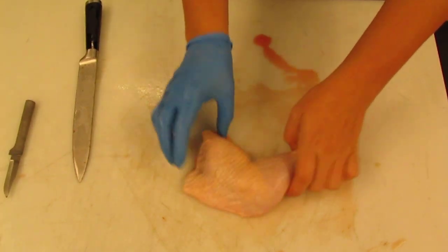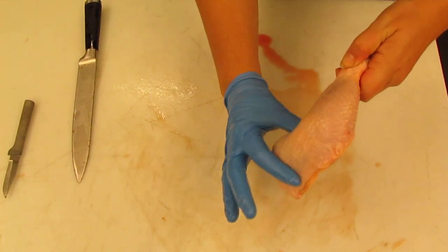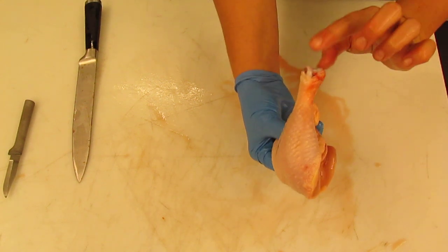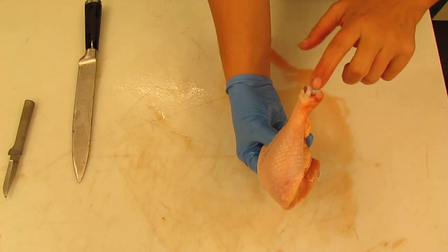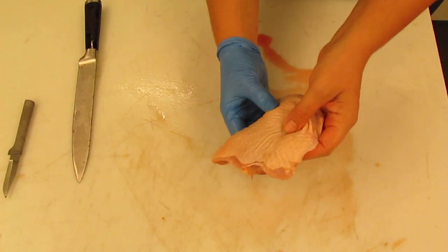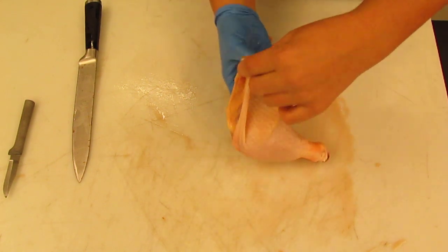Next, a little bit of orientation here. This is the thigh and what we would normally call the drumstick. This is the calf and the shin, which means that this is actually the ankle joint, and what we would call a chicken leg is actually just its foot, okay? So this is the knee joint.